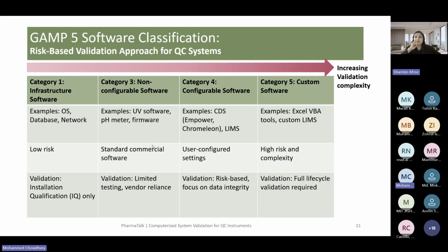They may be satisfied with the controls, and the system may be in a good place. They can still move to the LIMS to see the validation. And if some companies are not periodically checking the validated status of these LIMS, it's definitely their deficiency.